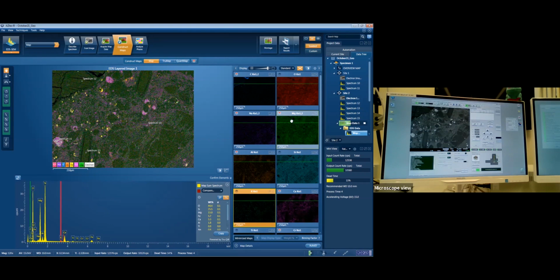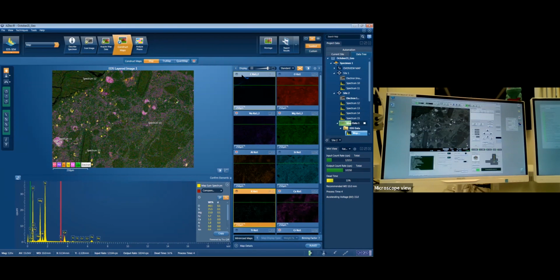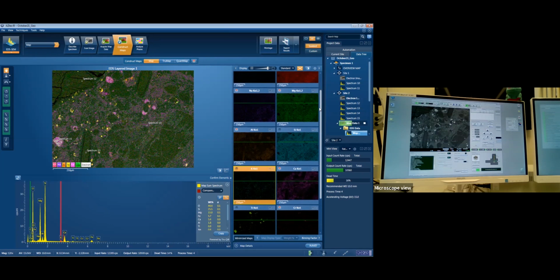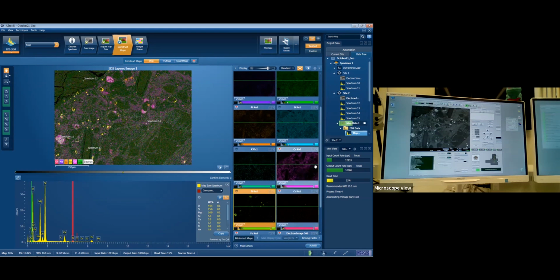And they look nice. If you get a really good one and you print it out big, it's very dramatic. Often we just play around with the color schemes a little bit, and try to find a nice one, which is normally tough. But I'm going to give it a go. We'll see what we come up with.